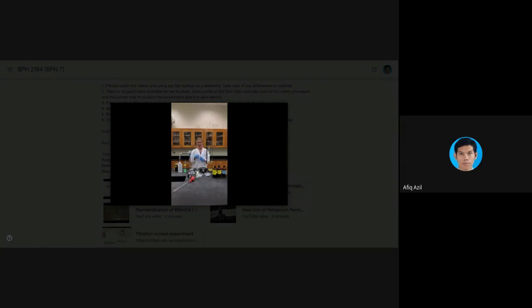But feel free, we don't have to use an Erlenmeyer. You can use a beaker. Now I would instruct, because once we've added water and acid, you're not going to have a ton of analyte volume, so we want to make sure that it's deep enough that you could definitely signify color change. So if you want to use the Erlenmeyer to prevent splashing and loss of liquid, I encourage you to do that. But you can use a beaker as well.